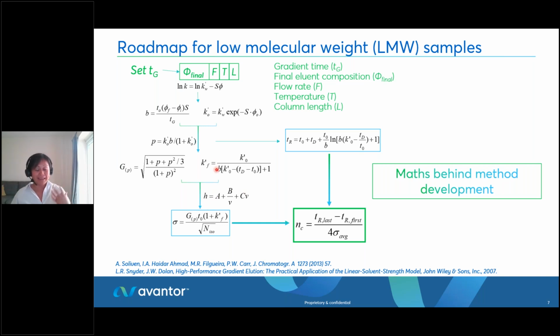If you have more expertise in gradient elution theory, you might catch that we definitely have the peak compression factor from gradient peak compression effects. That changes the peak width with respect to gradient elution theory, which may not agree with the velocity and peak width of the Van Deemter equation, curves and experiments.